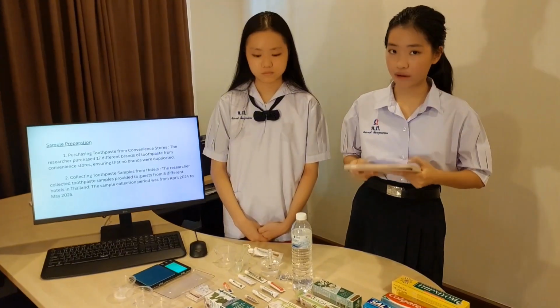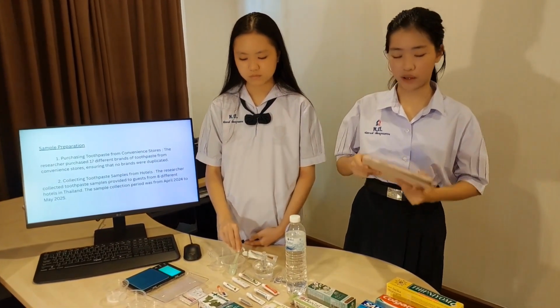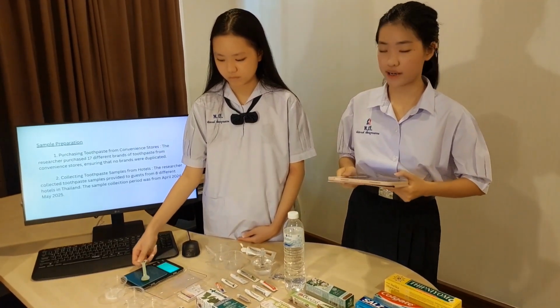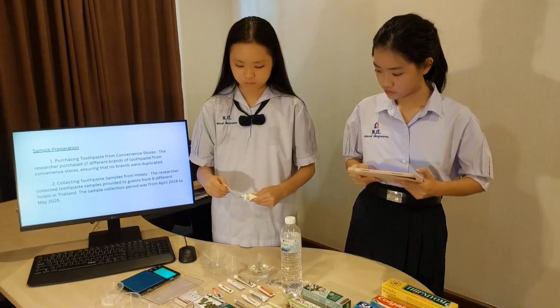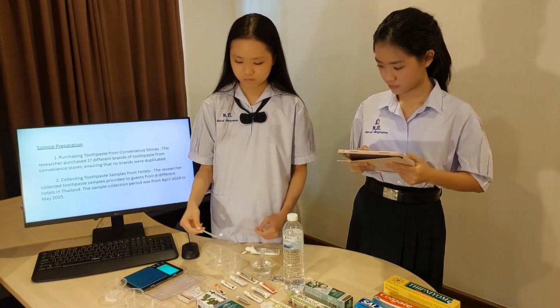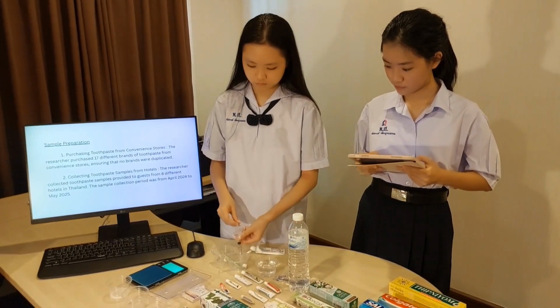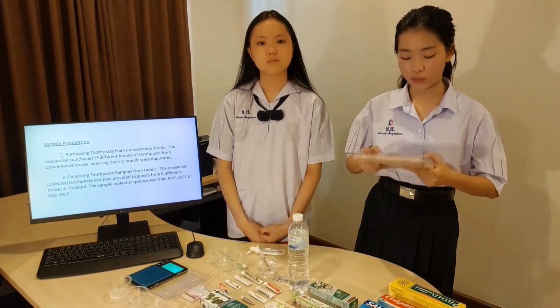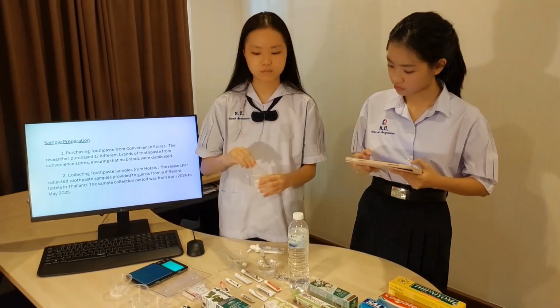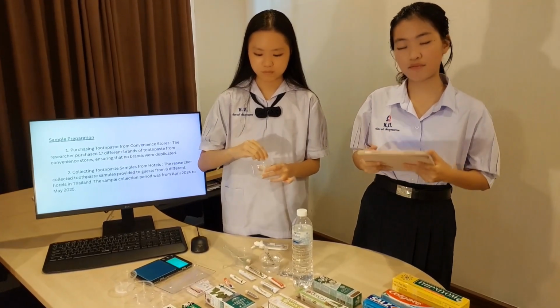Next, we have another ratio. Add a ratio of 2 grams of toothpaste to 3 milliliters of water. And the mass of the spoon is 2.61. Now, we have to stir until the toothpaste is fully dissolved. Ensure the solution is prepared at room temperature.